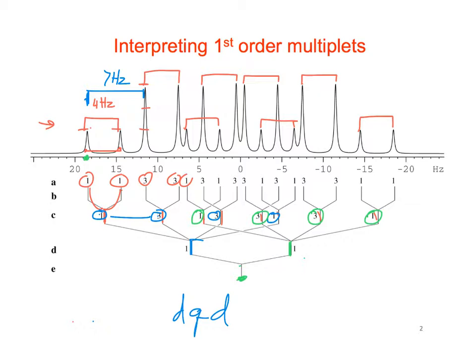So it would be from there to here, or from here to here. You have to just make sure it's from the same component. So it could be from here to here, right, or from here to here, I think, or you could measure any of those. And in fact, you should be able to measure those and they should match.